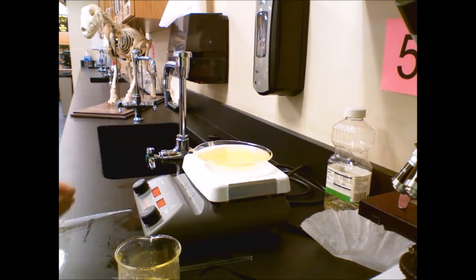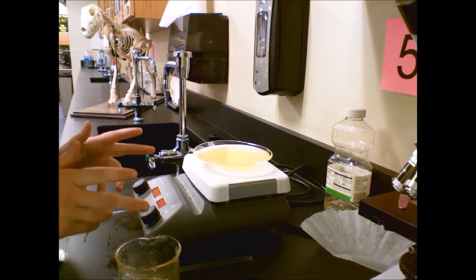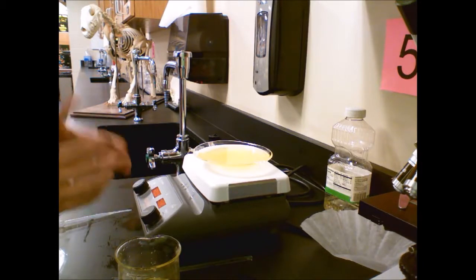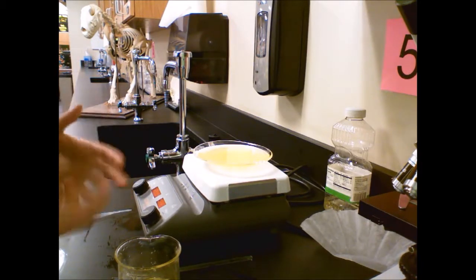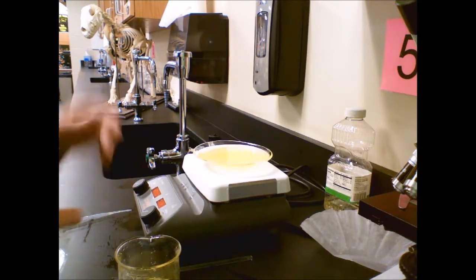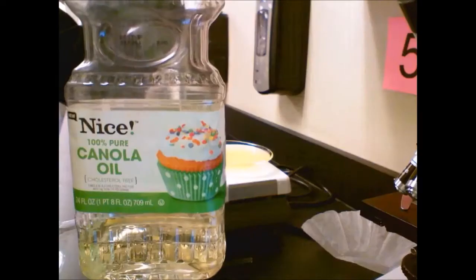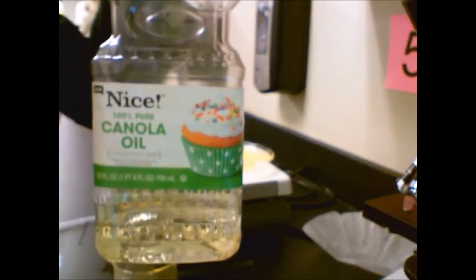Alright, so the original plan was to walk you through the whole process that I went through in trying to figure out how to get beautiful orthorhombic crystals of sulfur using canola oil as a solvent.